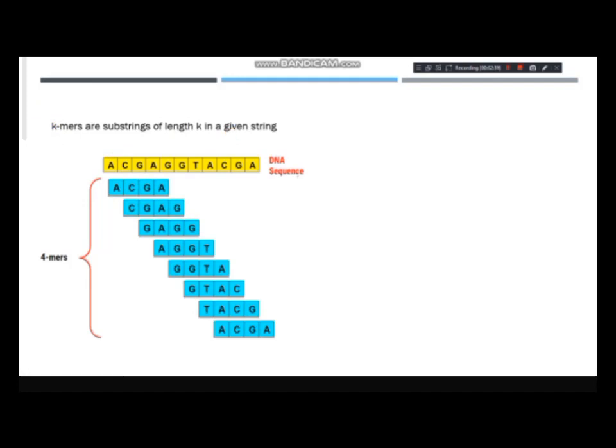What our project actually does is construct all the k-mers. If you said your k-mer size is 4, it constructs all the 4-mers, then, by doing some calculations, it provides their probabilities, and constructs these probabilities in a matrix. This matrix is then turned into an image. Okay, so this is the output, an image holding the probabilities of each k-mer.